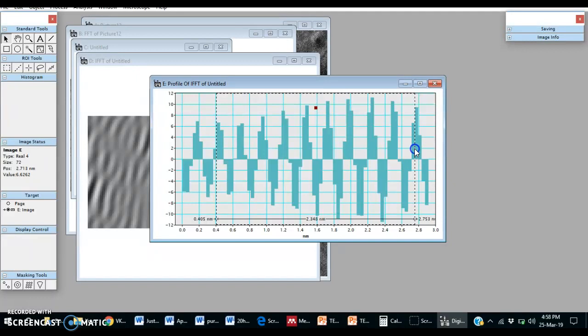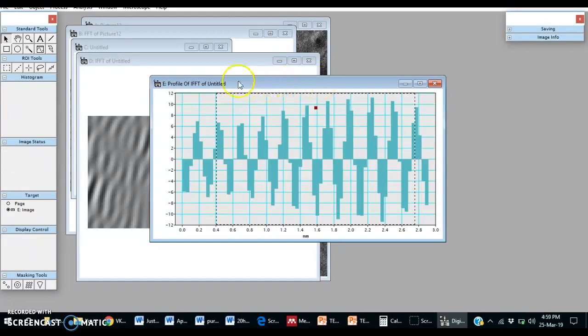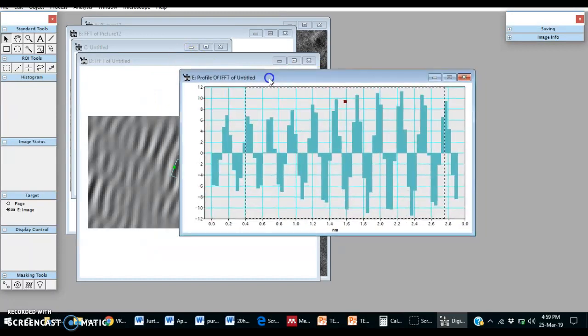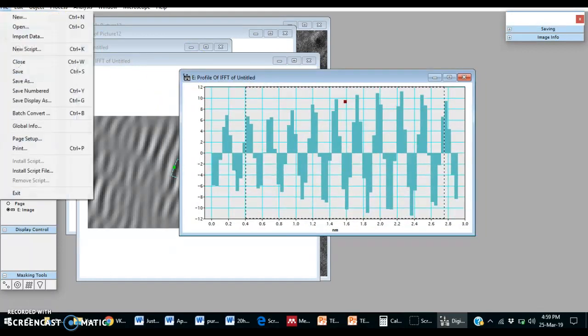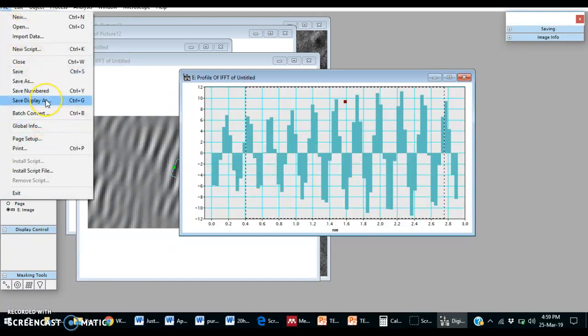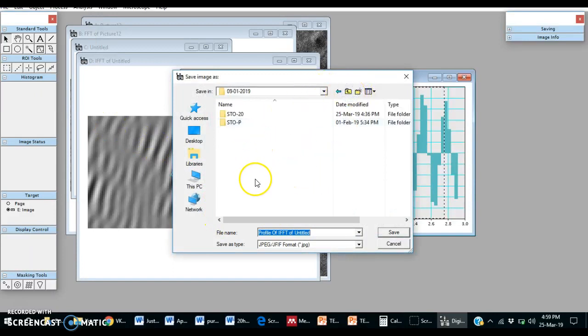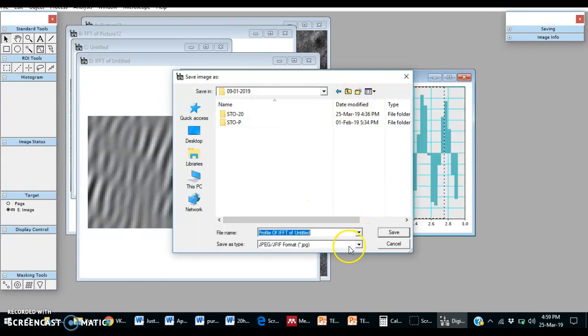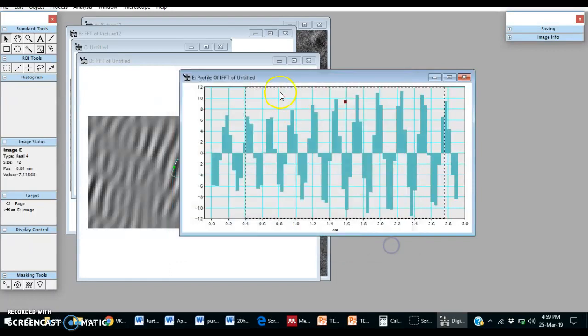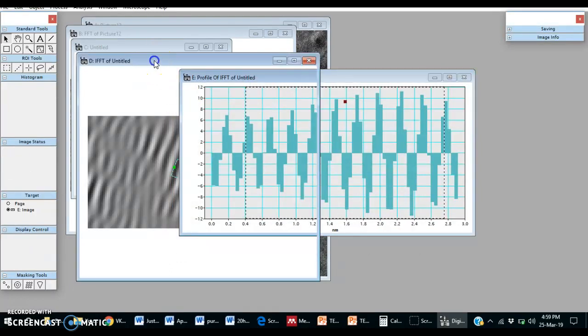Divide this 2.348 nanometers by nine. That will be the d-spacing. Then we can save these images. Go to File, save display as.